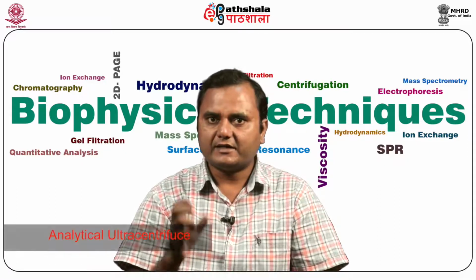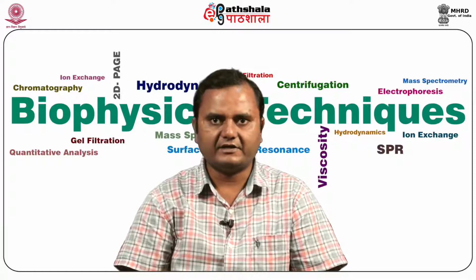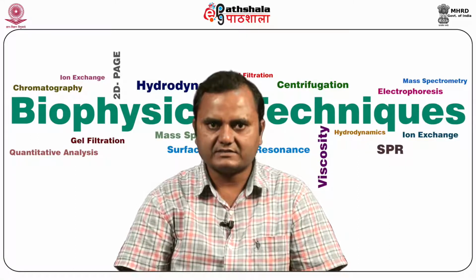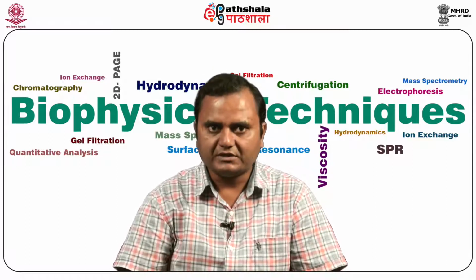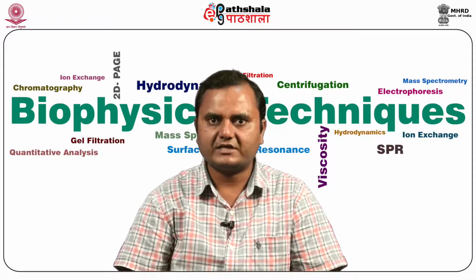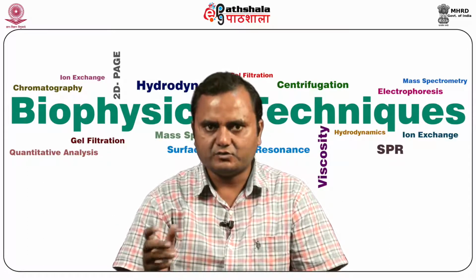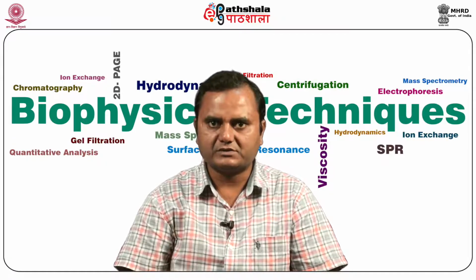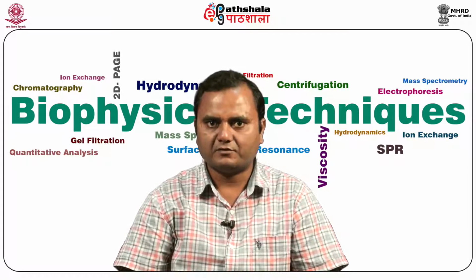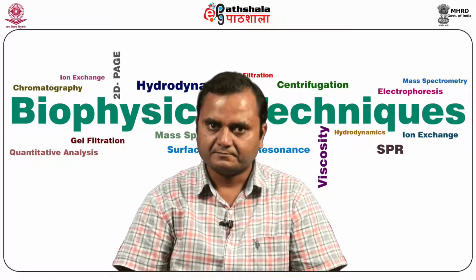So the analytical ultracentrifuge is the leading technique for determining the molecular mass, state of dissociation in solution, and association constant of the molecules. Even though it is little used for supramolecular polymers, this technique has already been shown to represent one of the best options for the characterization of this system.